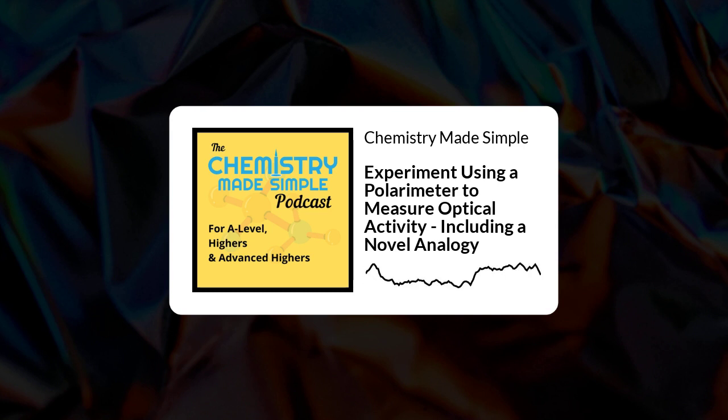Now, to do that experiment, we start with a light source, and that light has to be passed through a filter with some sophisticated parallel slits that only permit light waves with the plane aligned with those slits to pass through. So on the other side of the filter, passing further down the polarimeter, is the plane polarized light, only the light that's been allowed through. Of course the rest of the experiment is sealed off from any other light getting in. The light then passes through the sample in a sample cell and then onwards to be observed.